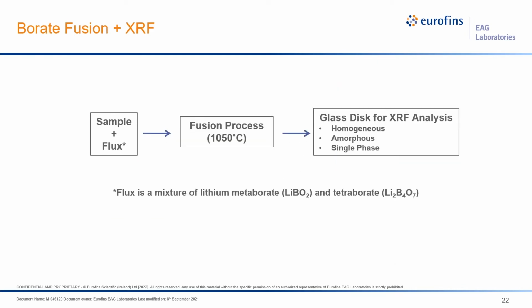Now we're going to look at a specialized sample preparation tool and see what advantages it can provide for XRF analysis. Some types of samples are very heterogeneous in composition, even within a very small sampling volume. As we've seen, this scenario can create a problem for accurate XRF quantification. A method of sample preparation often utilized with XRF to overcome this issue is fusing the material into glass discs.